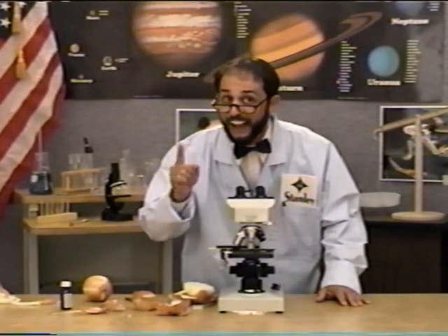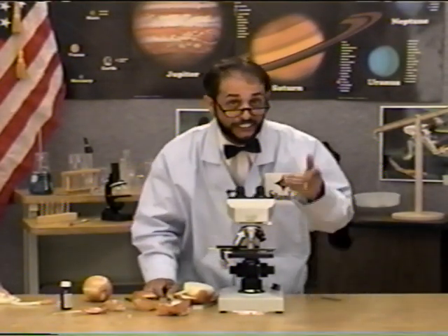These are some other cells. You'll notice nuclei and cell walls as we go by. Plant cells. They're a lot different than human cells, which you've seen, and animal cells as well.